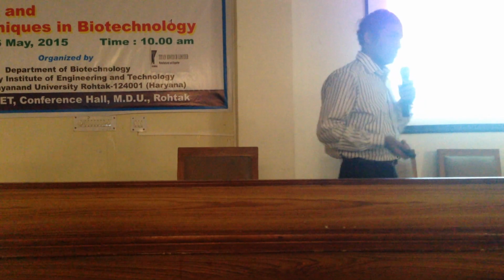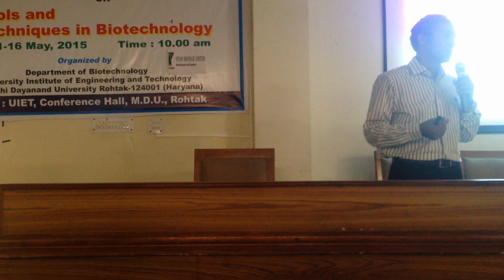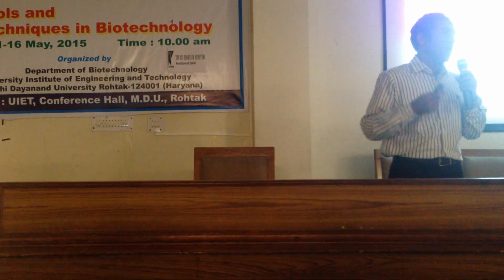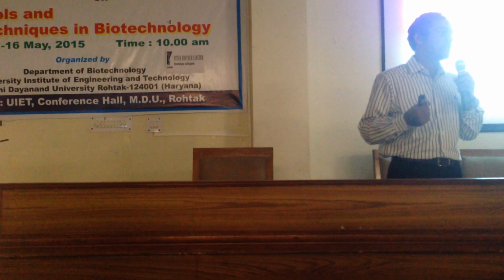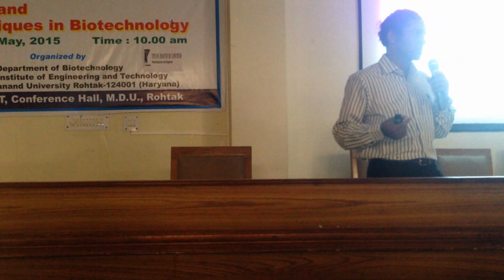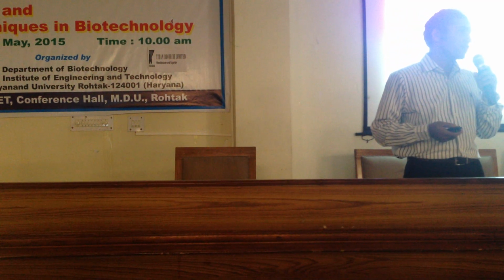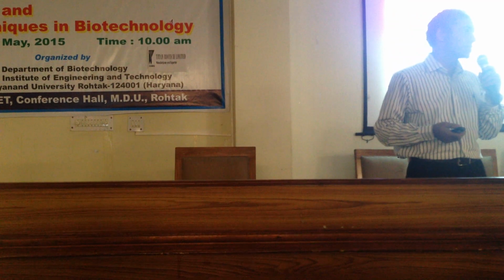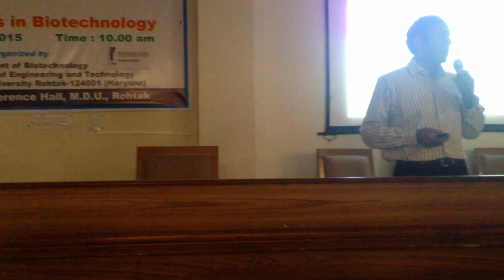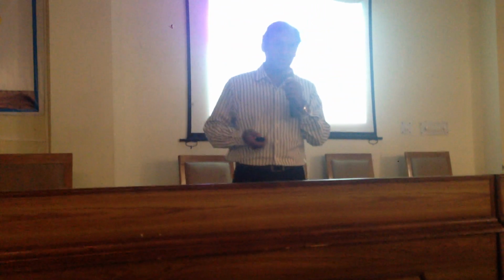So, to name a few, next generation sequencing comprises a group of platform technologies which have their own proprietary owners. These are the people who have taken patents over it. So, the first of these technologies is the 454 sequencing technology. It is popularly known as 454 sequencing, and in books, you will find this technology as pyrosequencing.